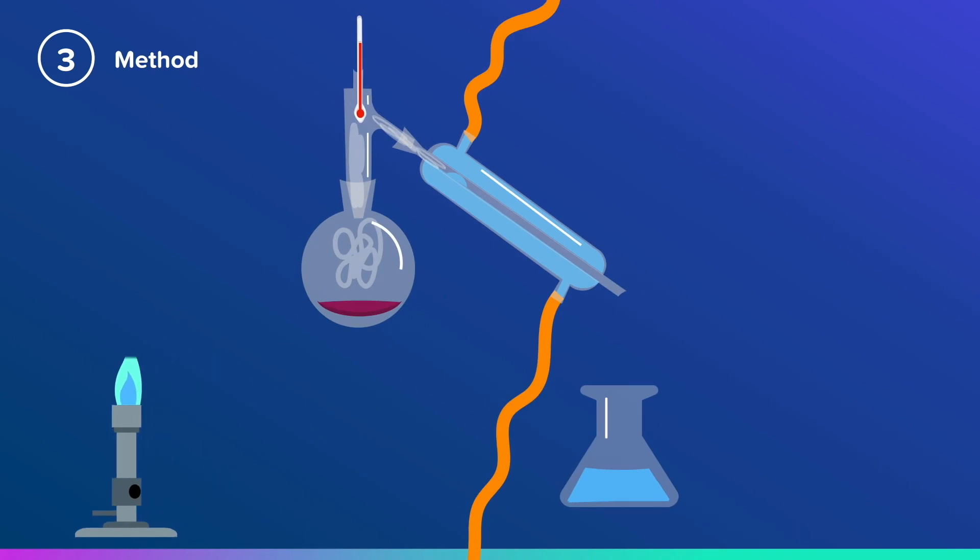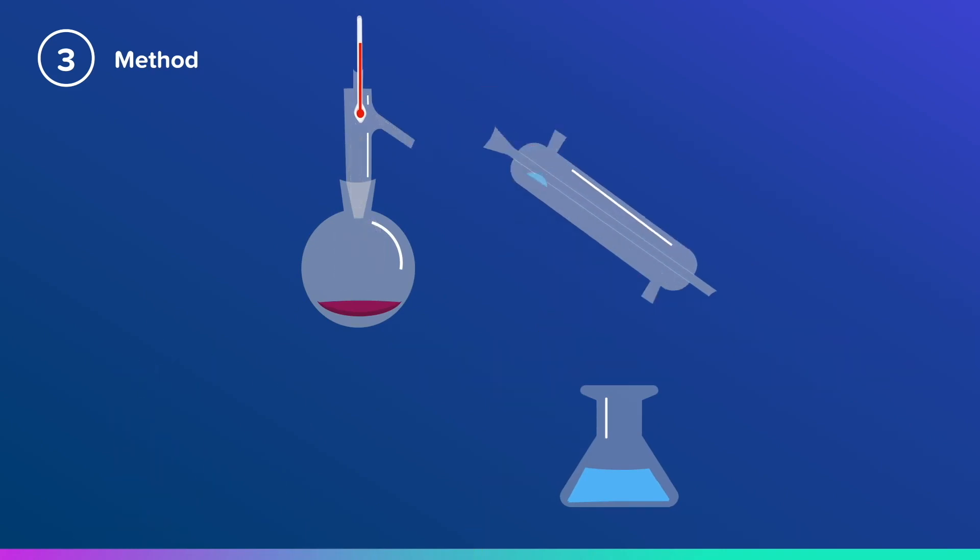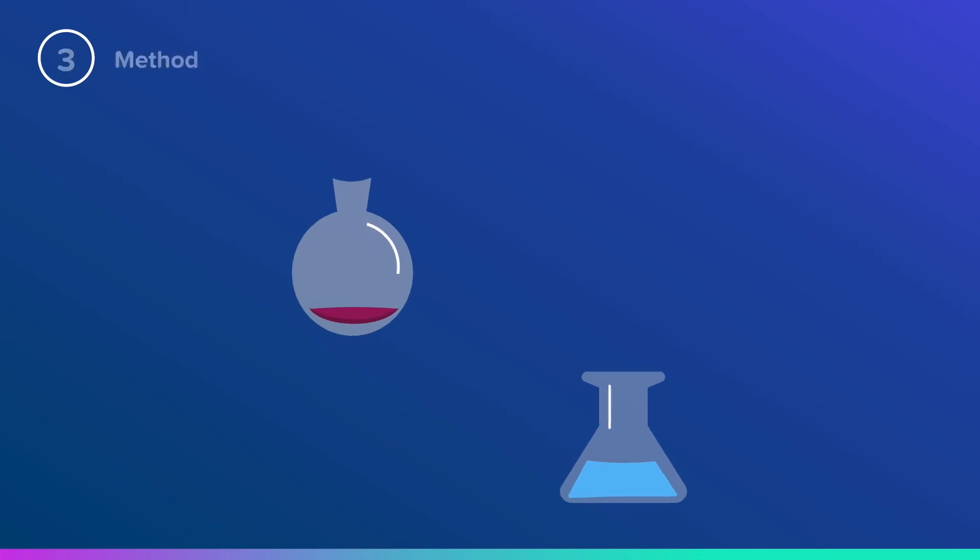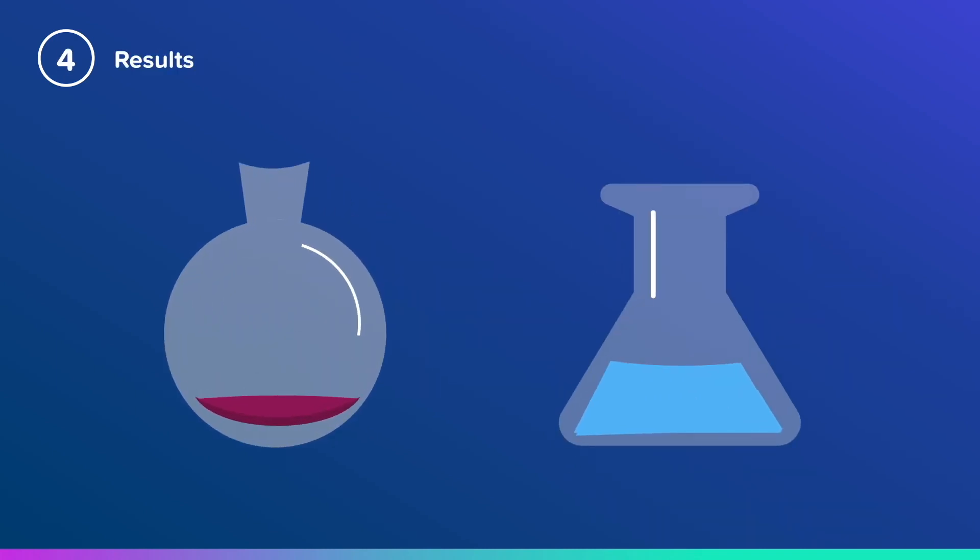Switch off the tap, and then carefully disassemble the apparatus, remembering that the round-bottomed flask will still be hot. At the end, the dye will be left in the round-bottomed flask, and you'll have pure water collected in the conical flask.